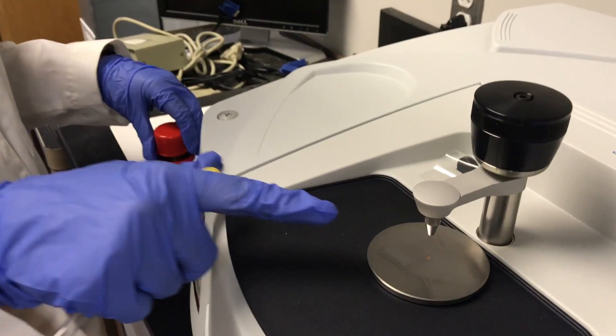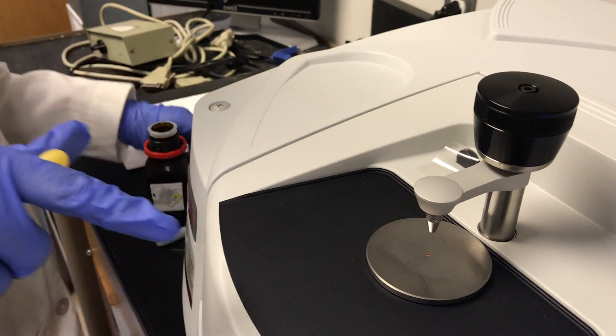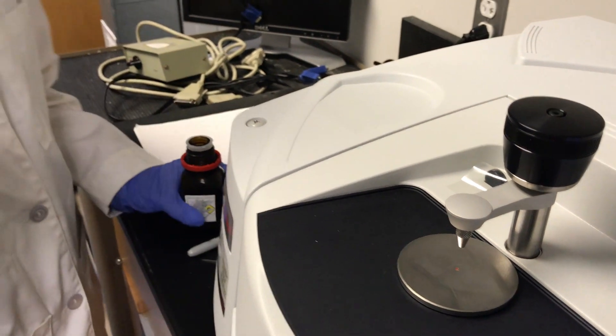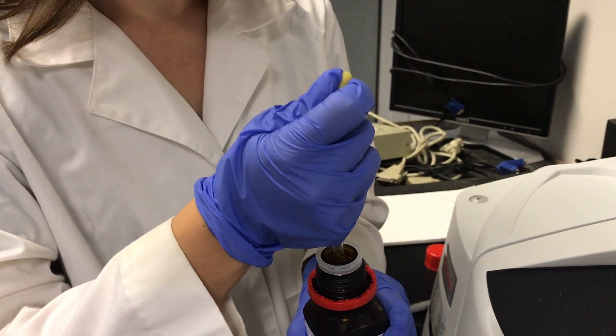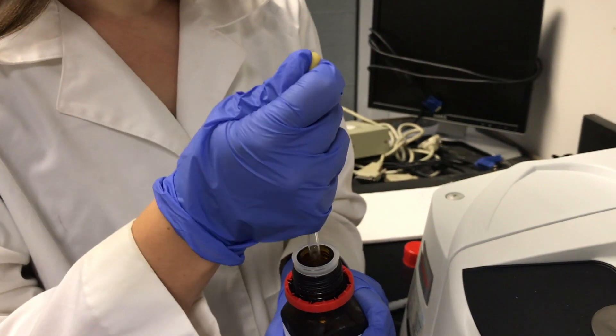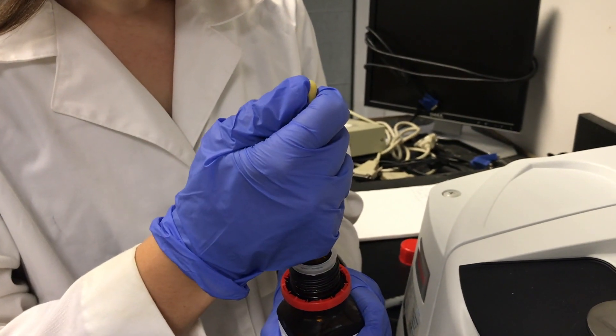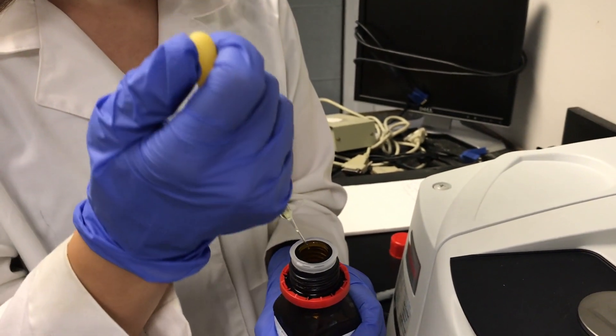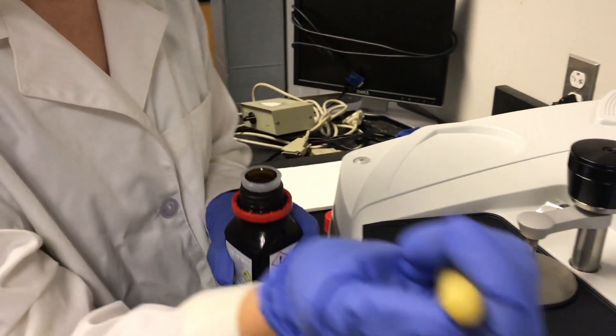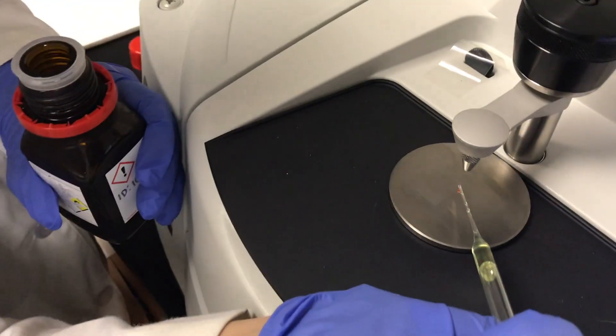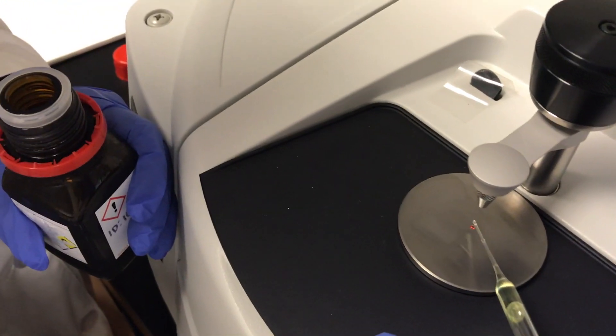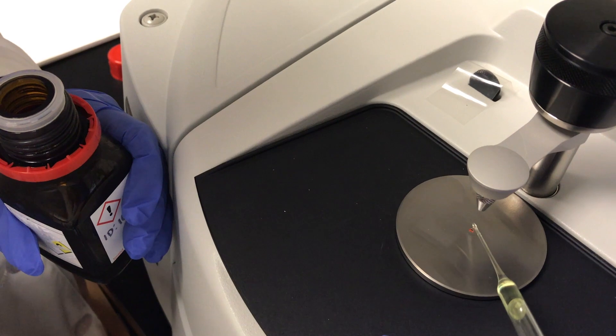Now that you have the correct accessory on and everything is all clean, we're going to use a glass pipette and take one drop of the sample and place it on the crystal. Again, making sure that you don't touch the pipette to the crystal. Really, you just need to cover the crystal.